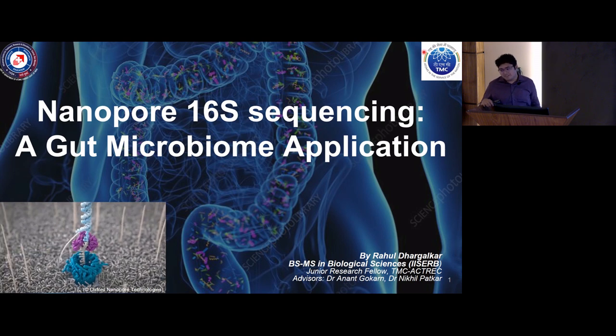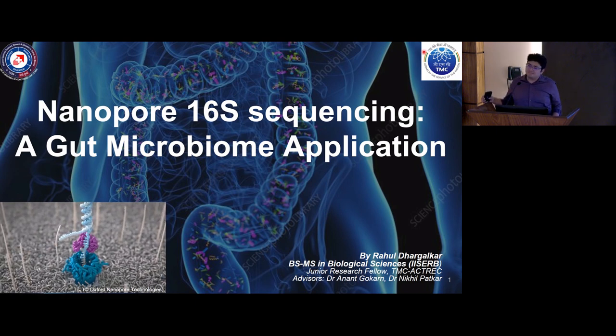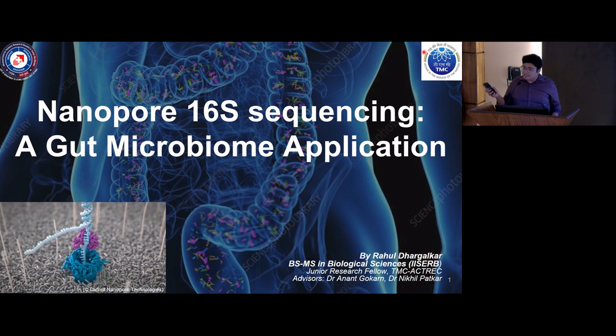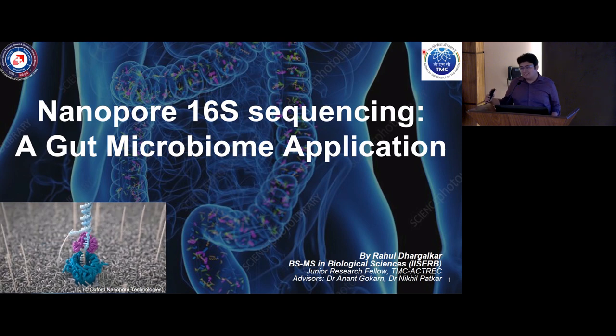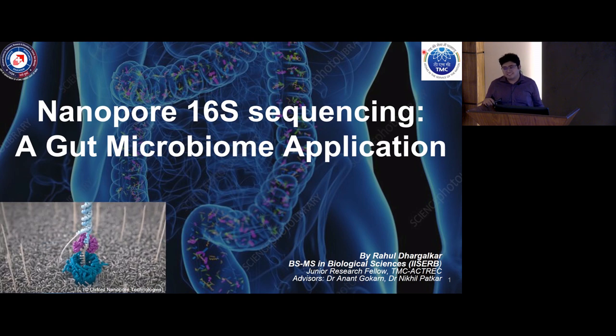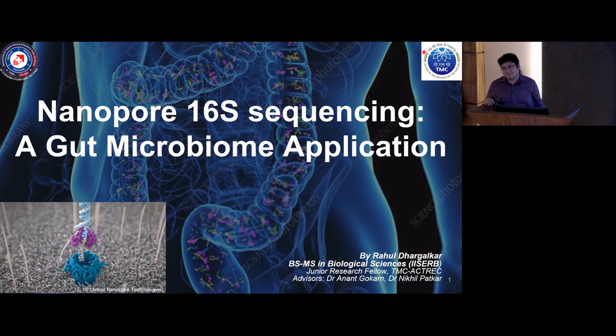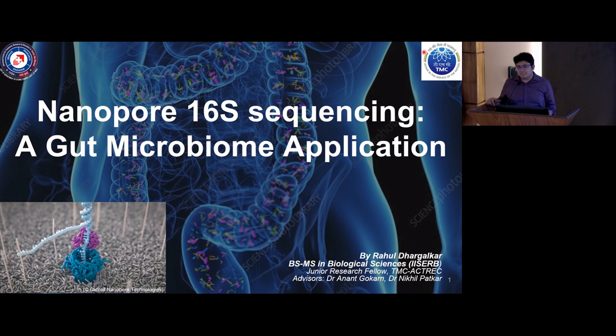But the scale of the whole genome is huge, right? You need to still do so many regions, and it's not cheap. I think he's asking adaptive sampling versus a whole genome. Oh, yes, sure, because you can do one sample in itself with relatively low cost. So this is done only on PromethION. It doesn't work on your MinION. You require a PromethION for that.